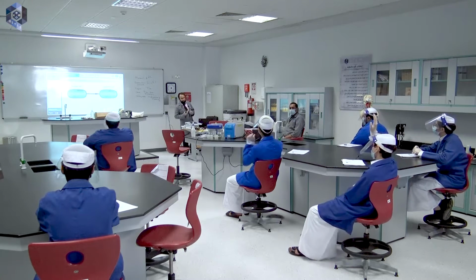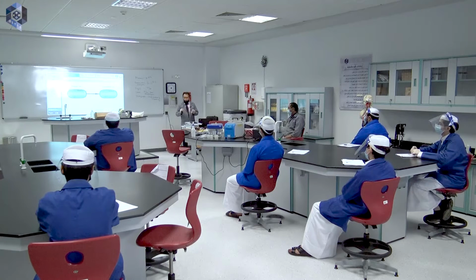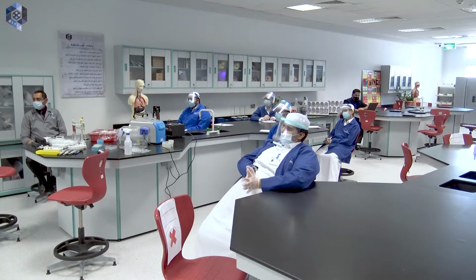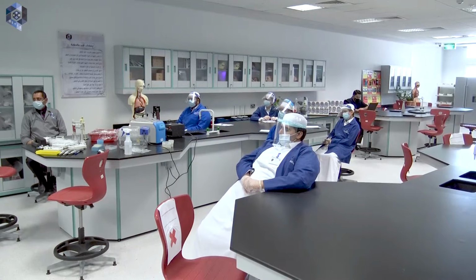Now, Ahmadi, do you agree with him? No, not exactly. What you have said is true, but it is for another treatment. We need to create gaps in the cell membrane and the cell wall, but not using CaCl2. The calcium chloride is used for what? To neutralize the charges. The charges of what? The cell membrane and the DNA, because both DNA and cell membrane are negatively charged, and negative charges repel each other, right? So to overcome this problem of repulsion, we neutralize the charges of DNA and the cell membrane using what, Marri? CaCl2. Absolutely true.